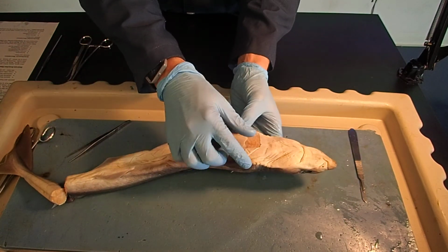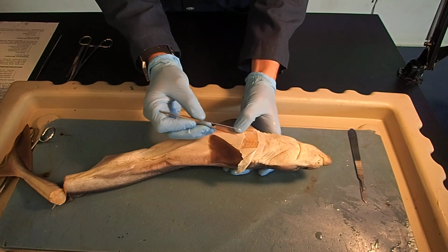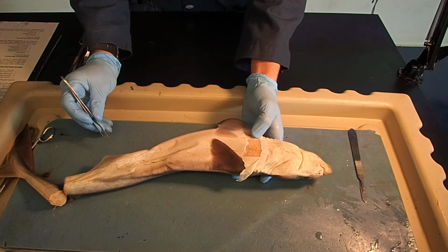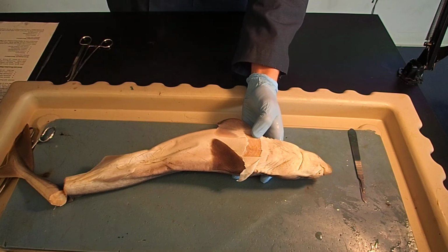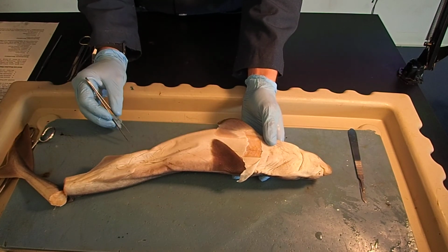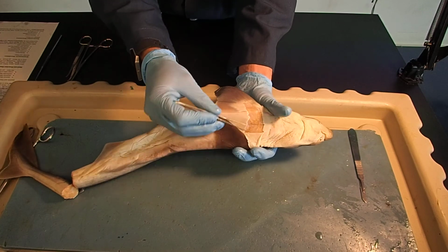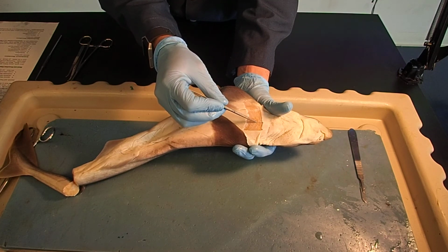If we look along the ventral side of the shark as well, you can see this line that goes down the very middle of the shark's ventral side. That line is linea alba. Think about that like as if you had an awesome six-pack on your belly. That line that's running all the way down the six-pack, that's your linea alba. Same here, this is the shark's linea alba. And it's basically separating the two symmetric sides of the shark, this side and this side. If you can see close in there, you'll see that these muscles are running on a diagonal from here down this way. And these are running on a diagonal from here down this way.